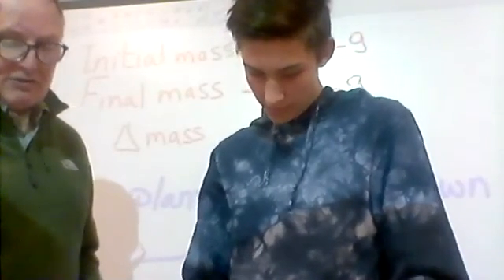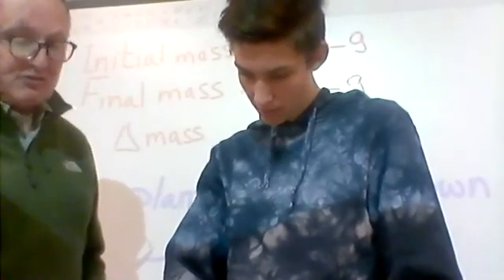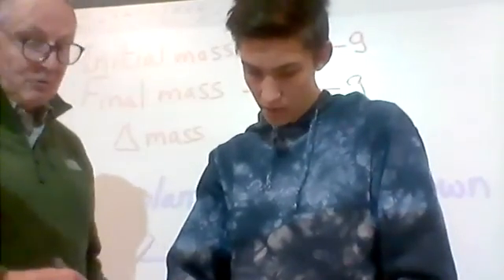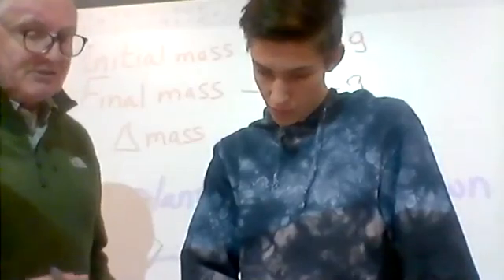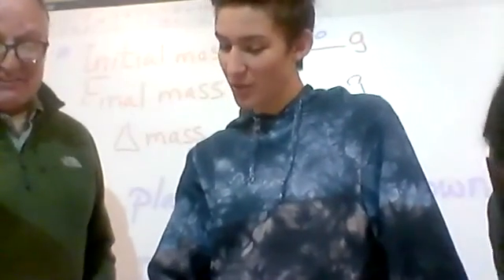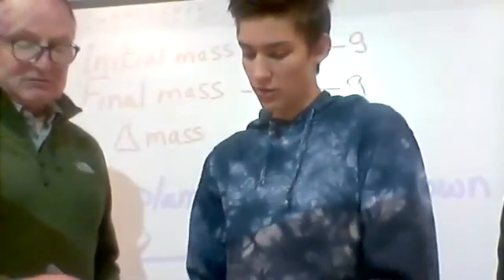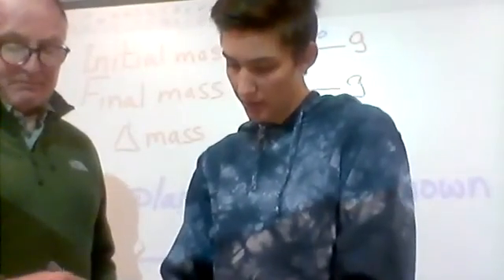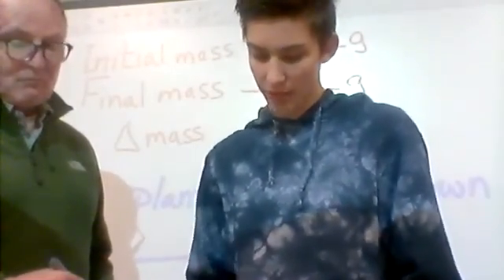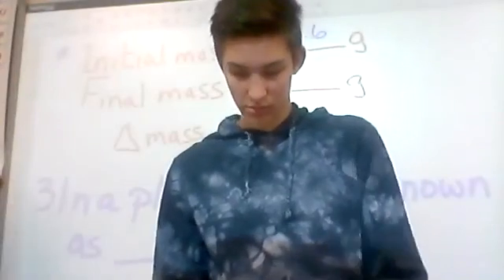Okay, so is there more solute? Where's the pure water? Where's the highest concentration? Inside. So it's the highest concentration there, low concentration out here. Okay, now what is this one? That's where it's the same inside and out. How do you know this one has a higher concentration? Because it's just water. This is water with salt in it. Is there any without H2O? Somebody's got to have H2O. That one is osmosis. No, it's this one.